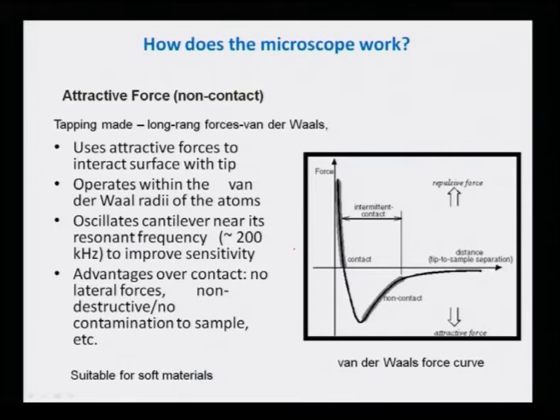No lateral forces will act on the tip, because whenever the tip is very close to the sample surface, there will be lateral forces which can act also, other than these vertical forces. Here there will be no lateral force, but the distance is higher. This is non-contact, so non-destructive. So, it does not lead to any contamination of the sample. It does not lead to deformation of the sample either. So, this is basically suitable for all kinds of soft material.